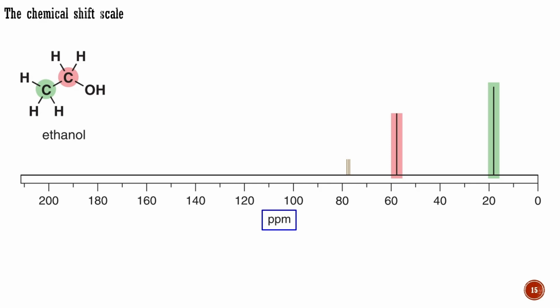The exact frequency at which the nucleus resonates depends on the external applied magnetic field. This means that if the sample is run on a machine with a different magnetic field, it will resonate at a different frequency. It would make life very difficult if we could not say exactly where our signal was, so we say how far it is from some reference sample, as a fraction of the operating frequency of the machine.